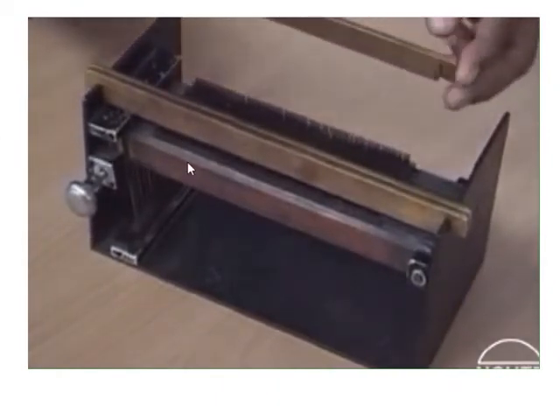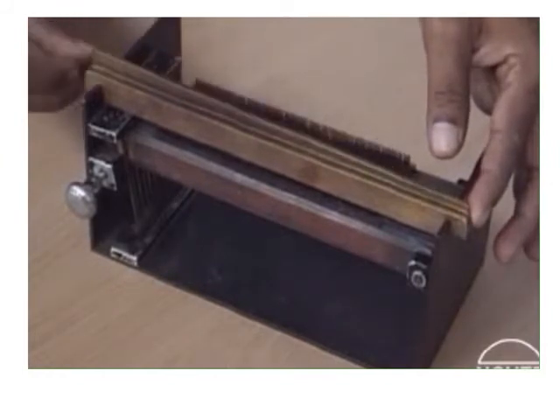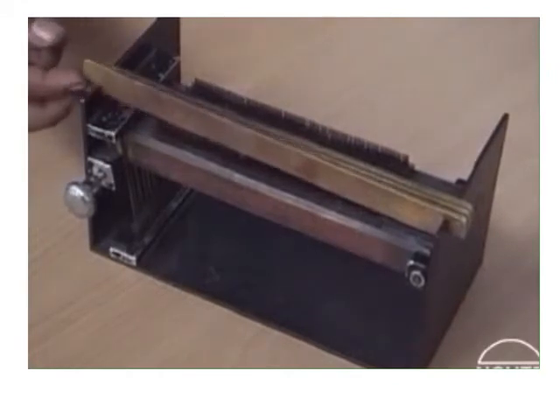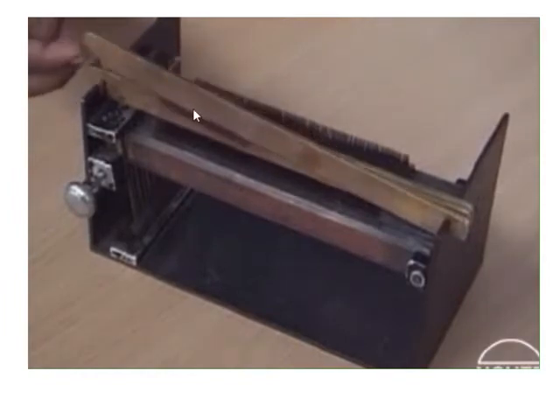So you can place the top combs in the grooves like this. Three top combs. You can see in this, the teeth are only towards one edge, towards the left hand side, whereas the bottom comb has teeth throughout its length. The top comb has teeth only towards one edge.